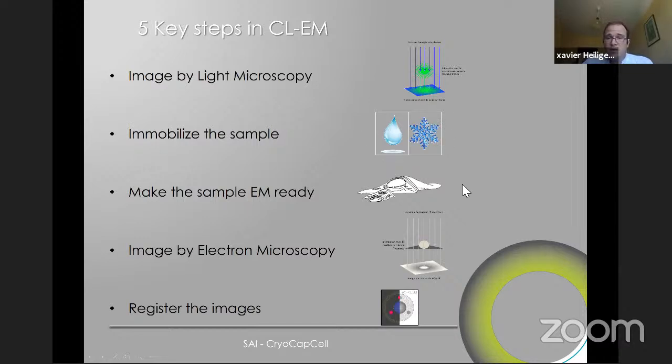And that's what we've seen before in the previous talk with the live cell imaging and fixatives, or in the cryo light microscopy where we did the fluorescence after the freezing. Or you can also have the fluorescence after the sectioning, which is preparing the sample and making it EM ready, which is also something you've heard from Claudio before. So as you can see already, the light microscopy that I draw here can happen here, here, and most likely not after the electron microscopy that tends to kill the fluorescence.